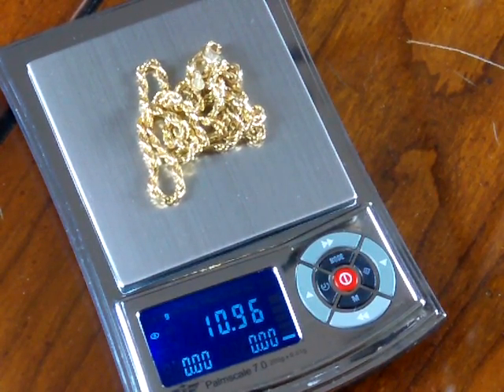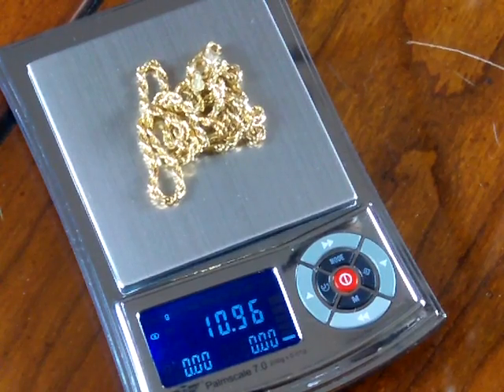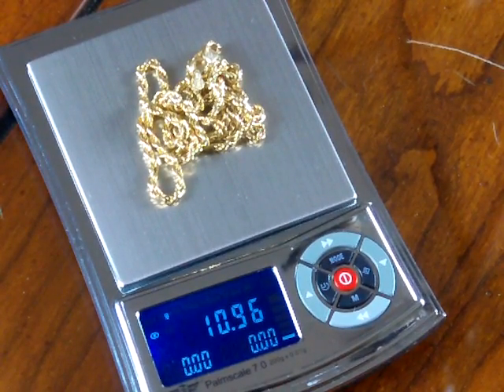Welcome to Balances.com and ScaleMan. We're Precision Weighing Balances and we're an authorized MyWay dealer.